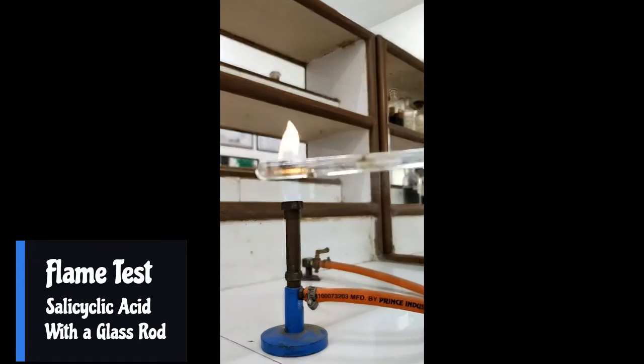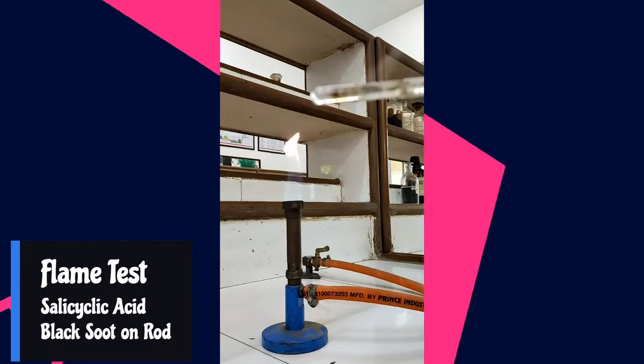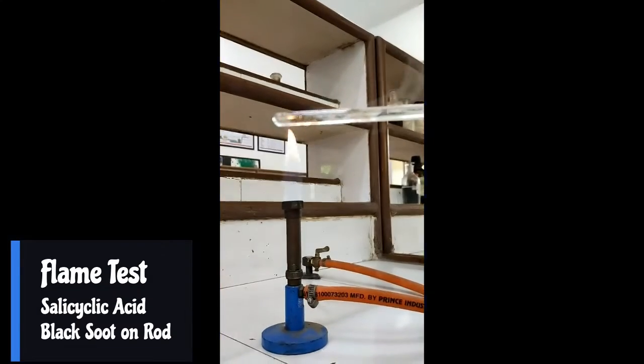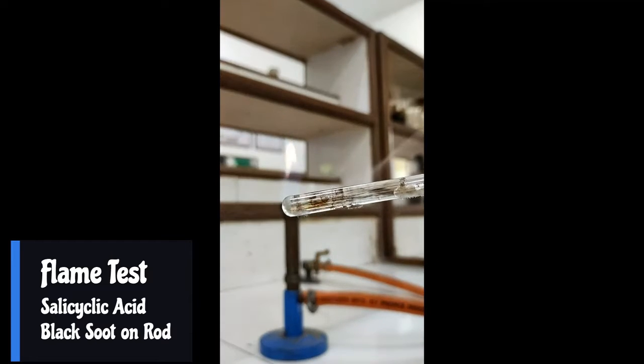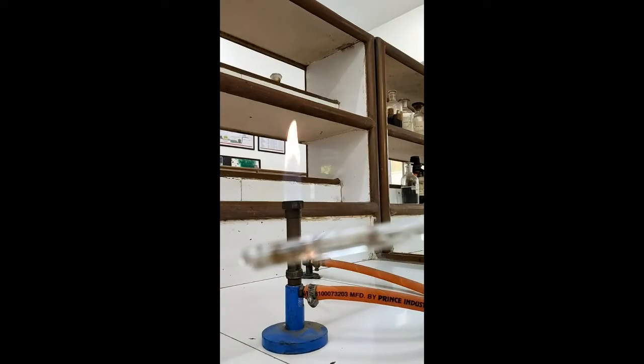If a sooty flame is there or the compound becomes black and gets deposited on the rod, then that compound would be aromatic in nature. So if the compound is salicylic acid, you will observe this kind of black soot.